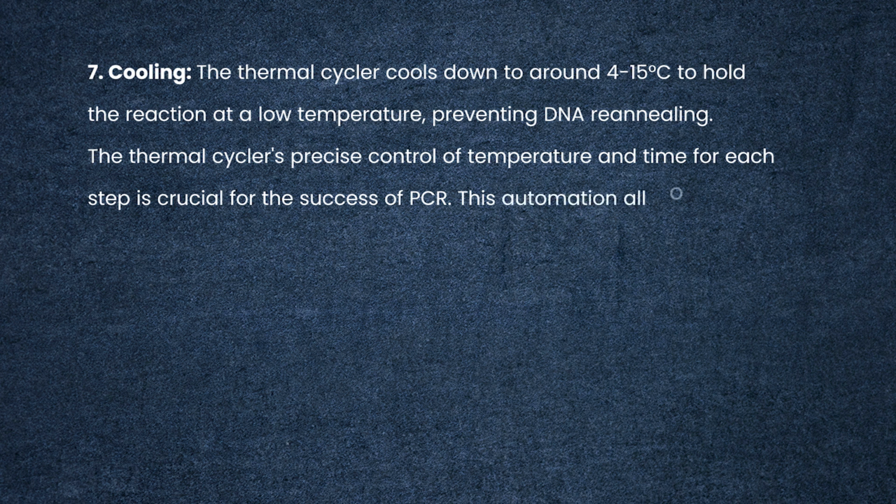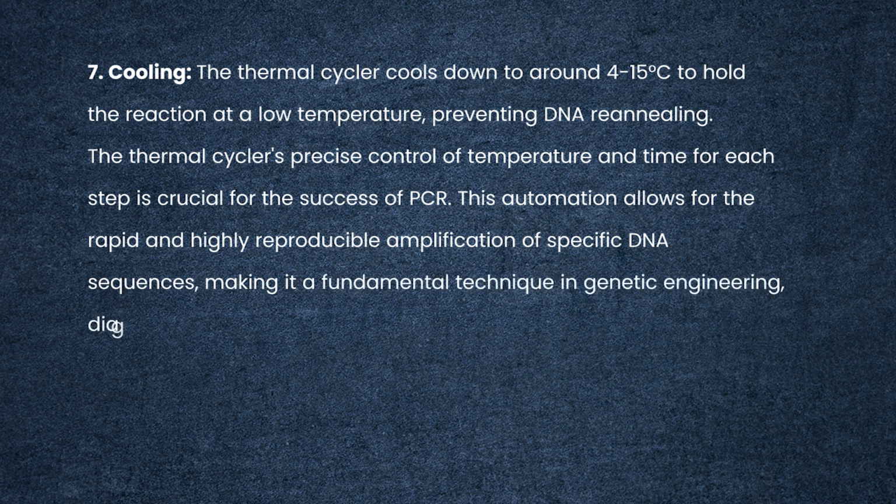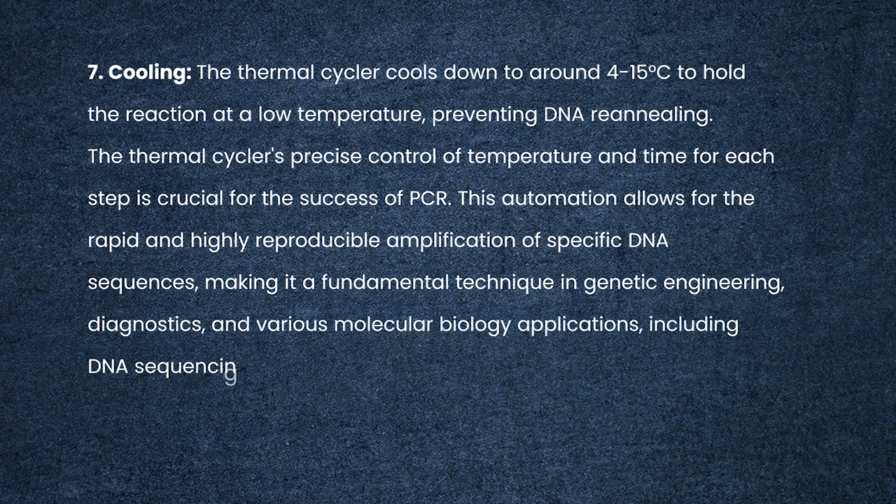This automation allows for the rapid and highly reproducible amplification of specific DNA sequences, making it a fundamental technique in genetic engineering, diagnostics and various molecular biology applications including DNA sequencing, gene expression analysis and DNA cloning.